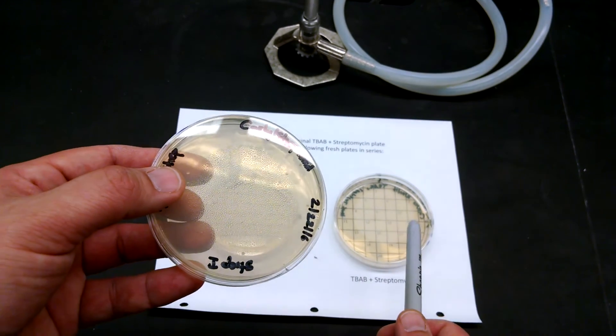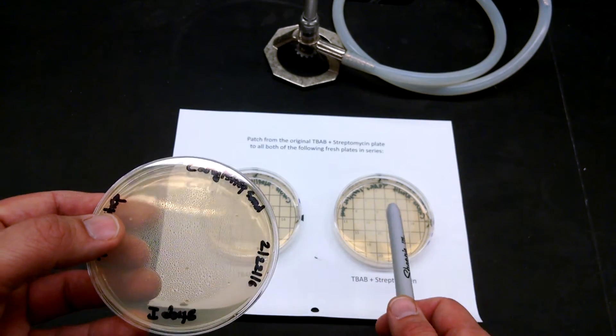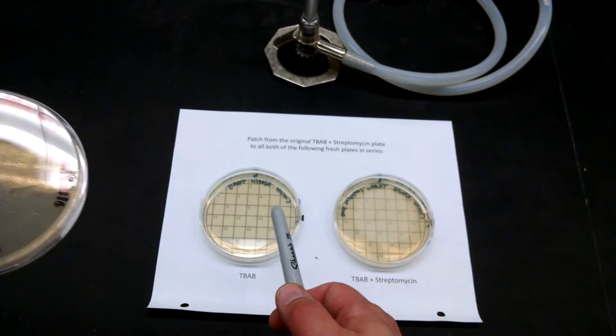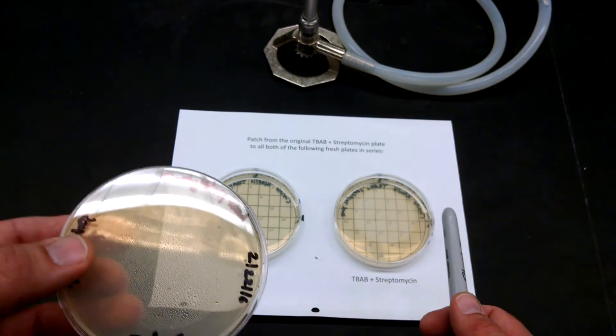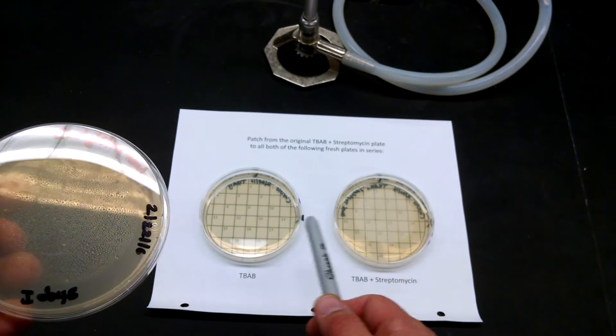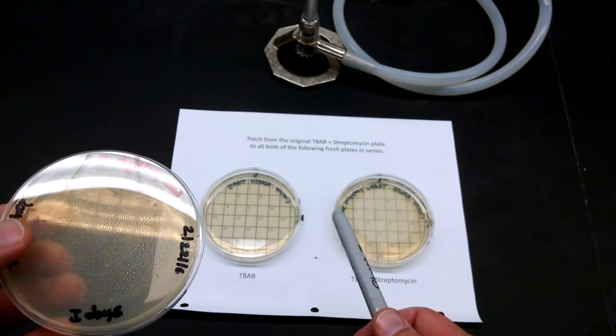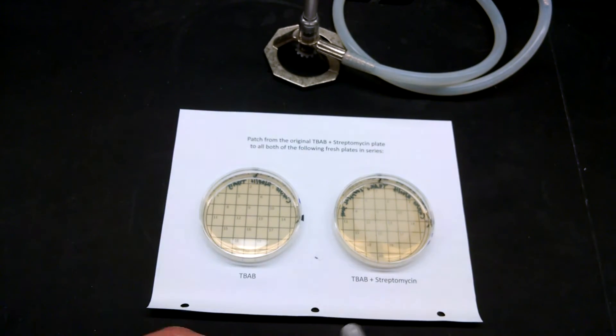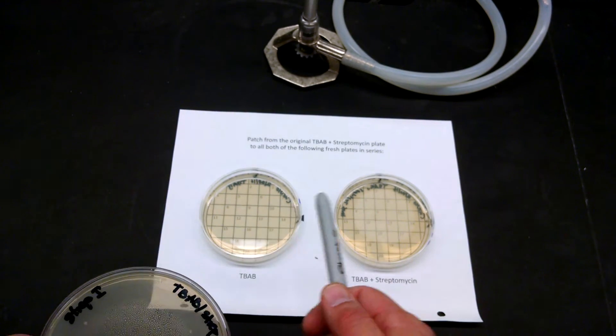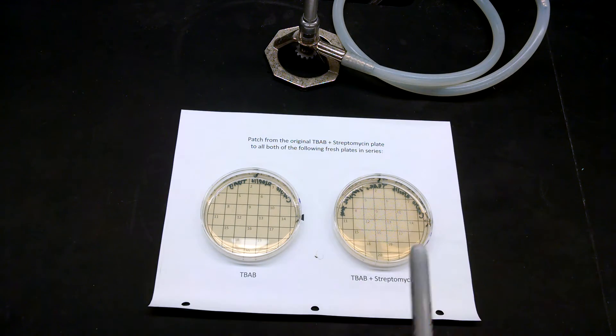That way, if nothing grows, we know there was a problem in the patching, right? If nothing grows here and something grows there, we know it's real. If nothing grows on this one but something grew on that one, we know it was a problem with the patching. So that's a control. Always do the new thing first and then the old thing last.